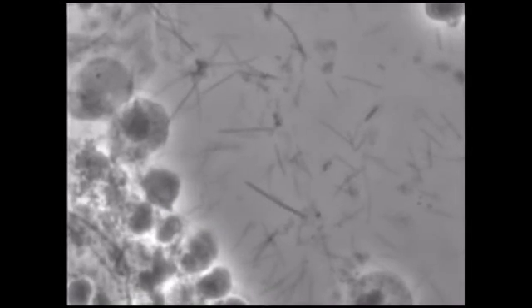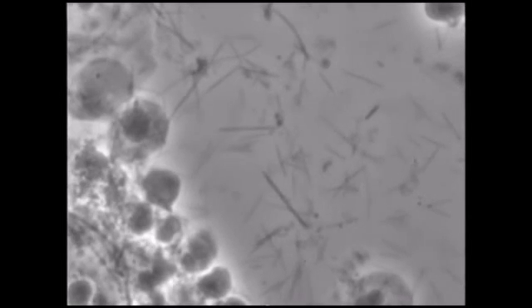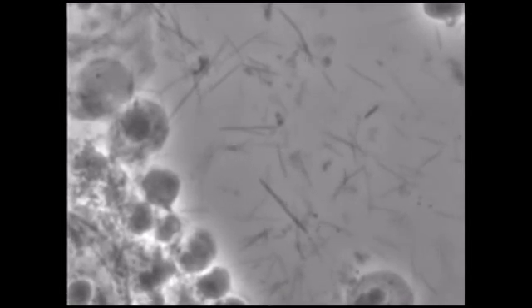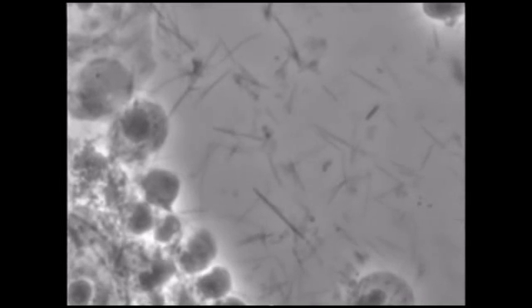These stick-like bacteria are called cytophaga or clock arms. They attach themselves at one end and spin around like the hands of a clock.